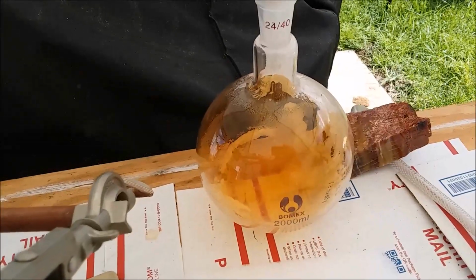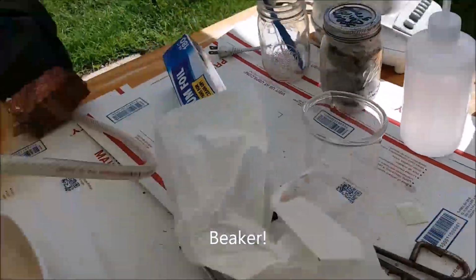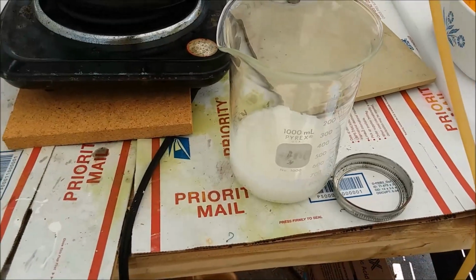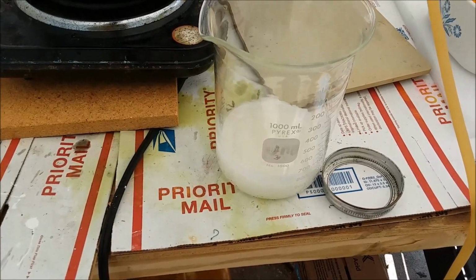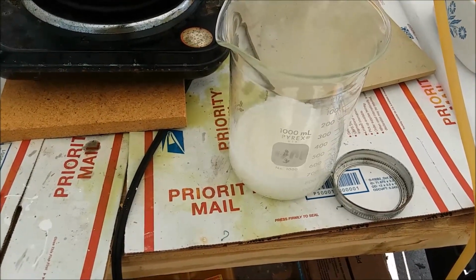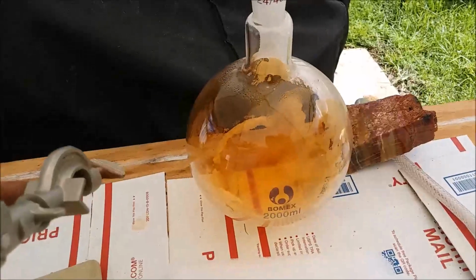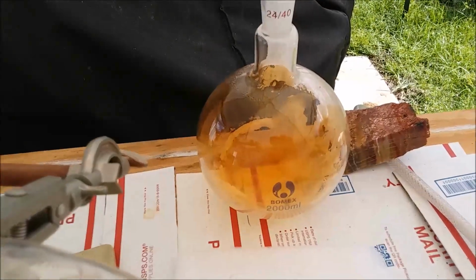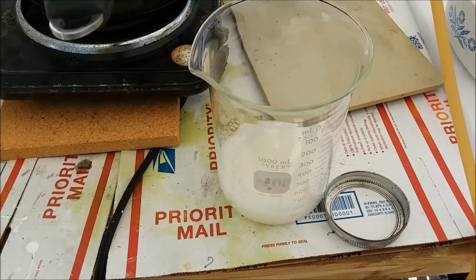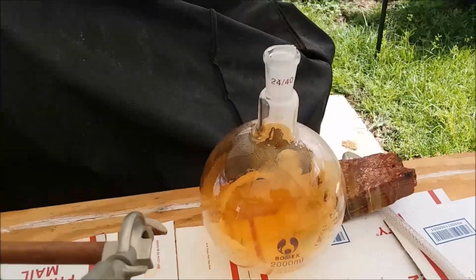I poured the semi-molten sodium bisulfate out into this flask here, and that should make cleanup of the boiling flask a lot easier. In fact, I need to find some disposable container to just dump this into while it's still semi-molten and get rid of it, so I can clean up this flask, or this beaker too. So that worked pretty well, because it takes hours, even on the heat, to dissolve the slug of solidified sodium bisulfate in there. So this should be very helpful to get that out while it's still hot.